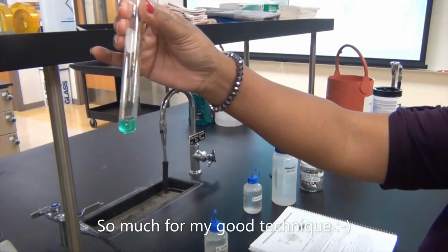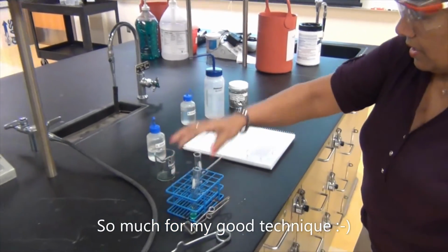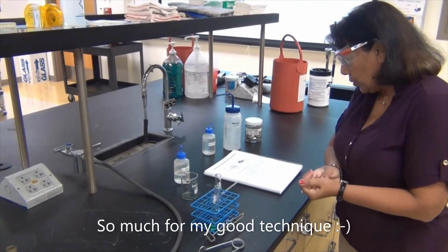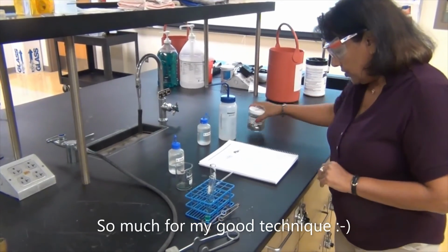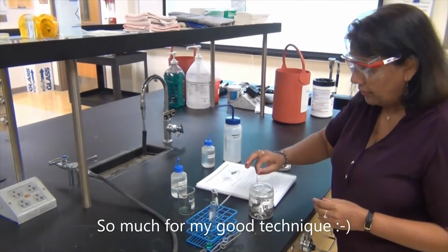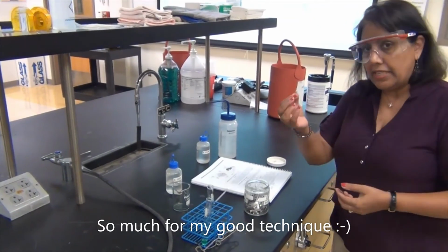Okay. So this is the sulfuric acid. And now the last step. In the last step here, it says to dilute the solution with the DI water. So I'm not going to dilute it because I've done this reaction before and it doesn't quite work very well if we add water. I would have told you that if you were in the lab, but even otherwise, now that we're doing it here, I'm just going to go ahead and add magnesium to this now.